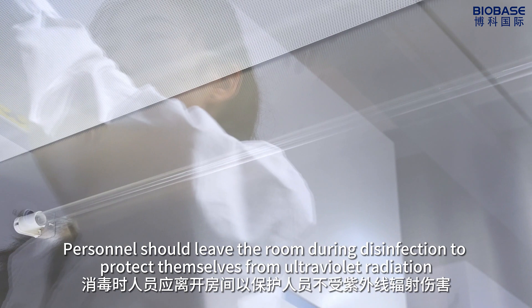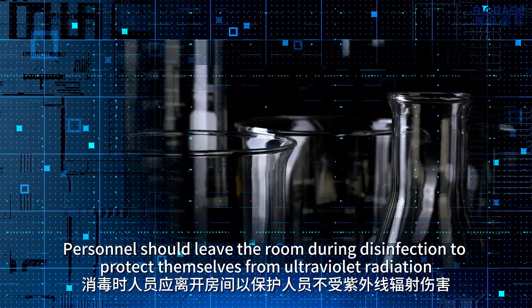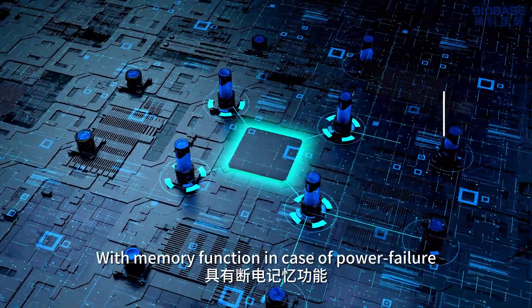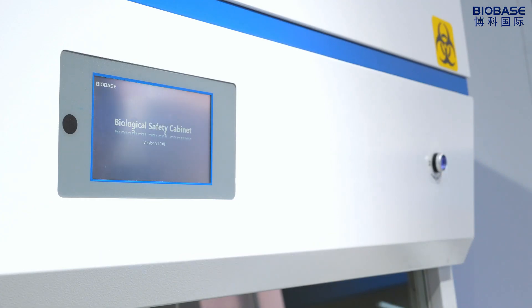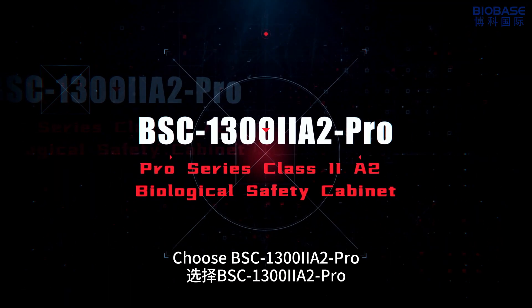Personnel should leave the room during disinfection to protect themselves from ultraviolet radiation. After disinfection, the UV lamp will turn off automatically. The unit has a memory function in case of power failure. The working area is made of 304 stainless steel. For a high-quality biological safety cabinet, choose the BSC1300-A2 Pro.